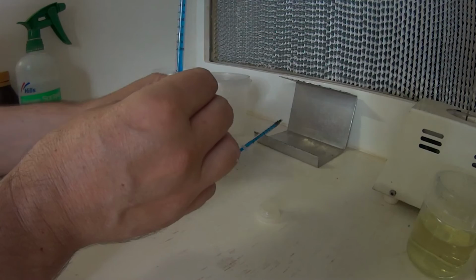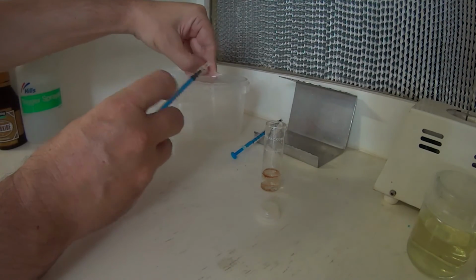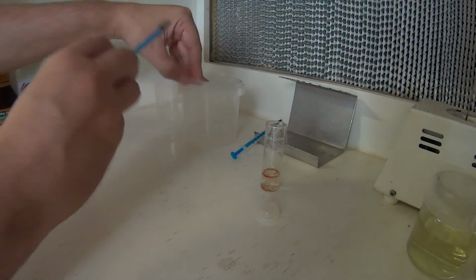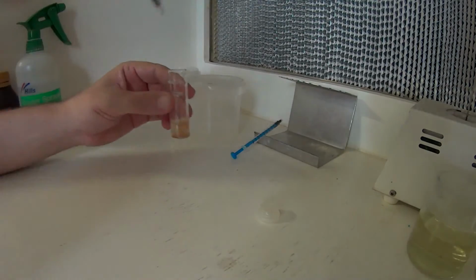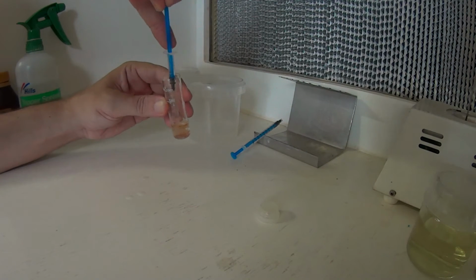Alright, we've got a lot of it in there now, so what I'll do is simply and hopefully just inject this into there. Now we have got some in there, so we'll just repeat the process again, simply sucking up some of this orchid seed.